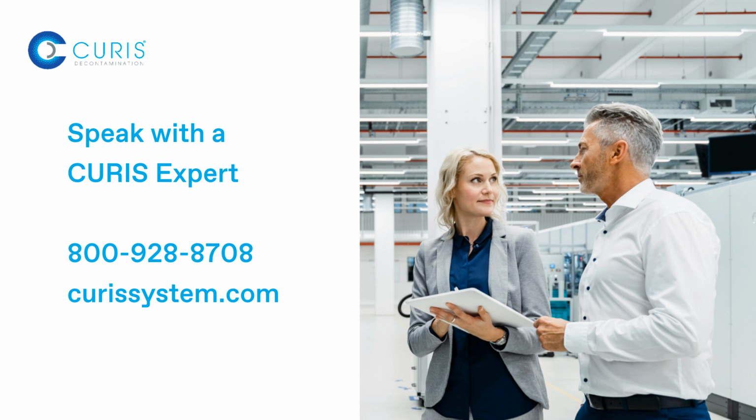Sometimes the fastest path to improvement is external insight. Consulting sterility experts helps labs troubleshoot persistent issues, refine protocols, and stay aligned with evolving best practices.